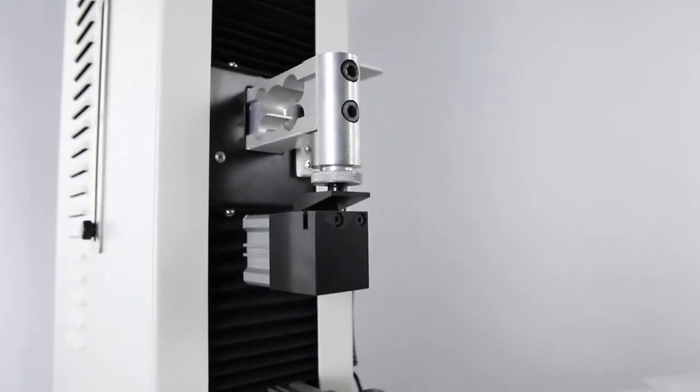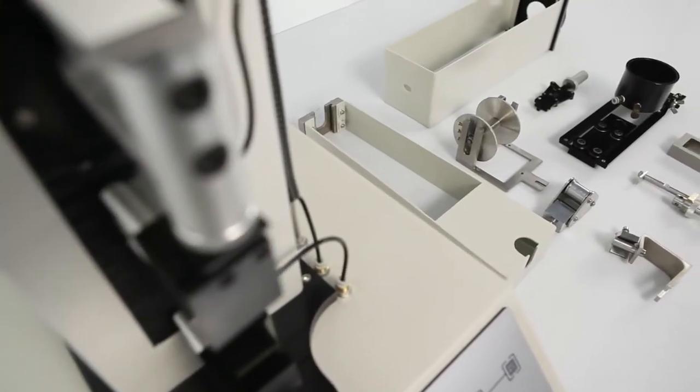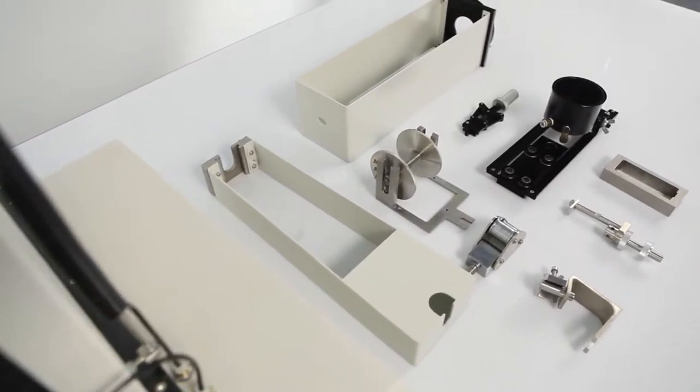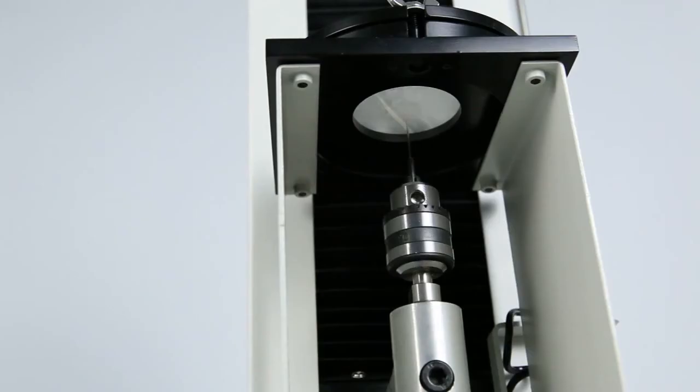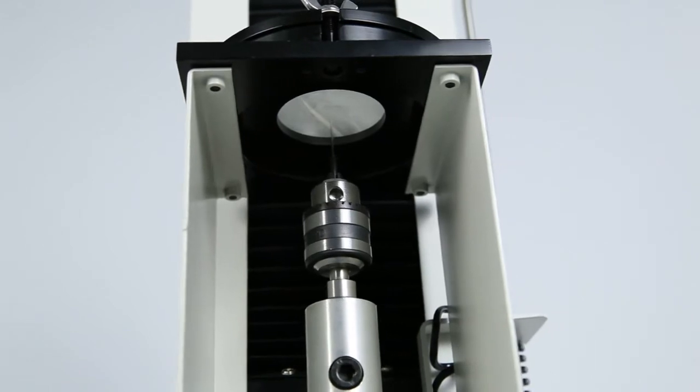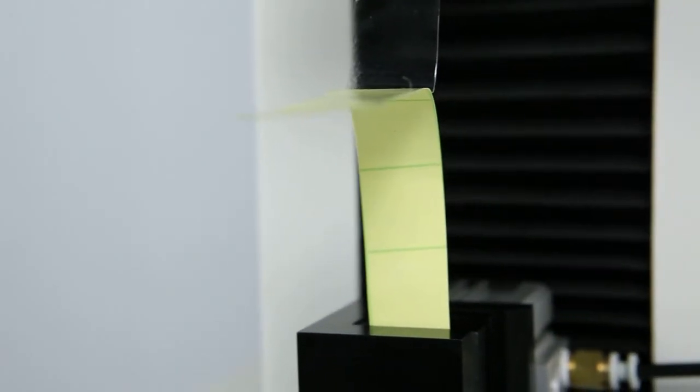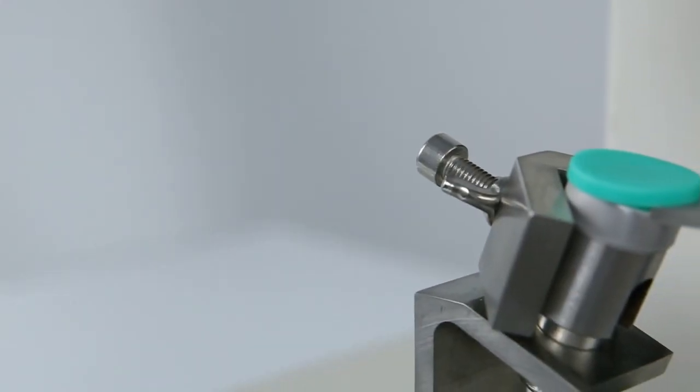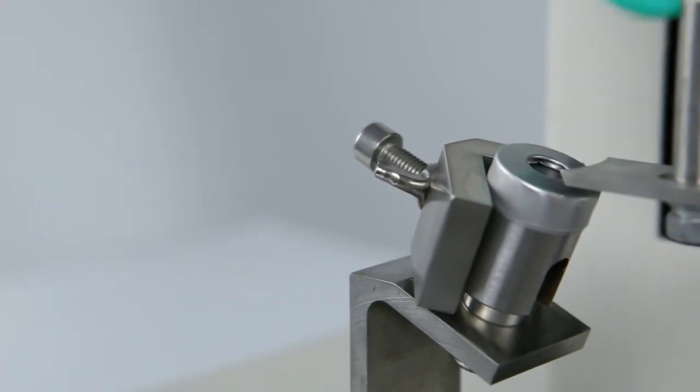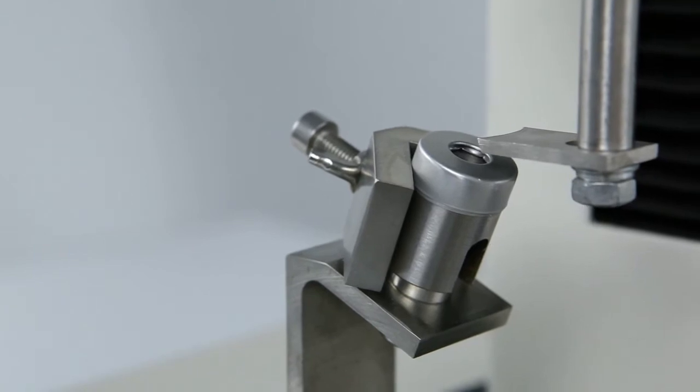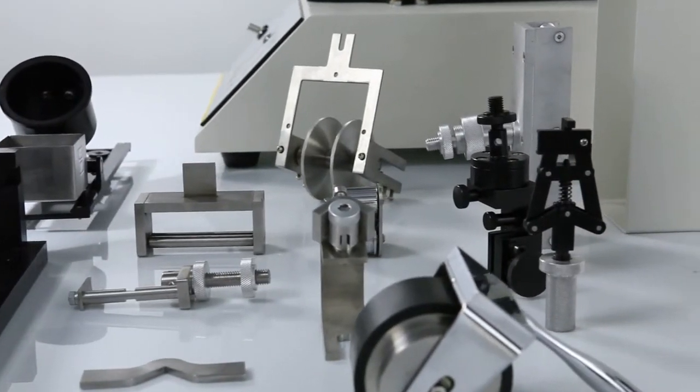With customized testing fixtures, this tester can be expanded to perform a variety of other special tests, such as puncture resistance of films, opening force of jelly cups, peeling force of release paper, opening force of caps made of aluminum-plastic combinations, and many more, becoming a multi-functional tensile tester.